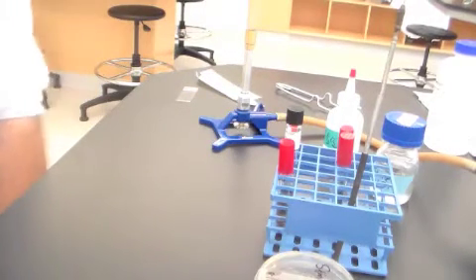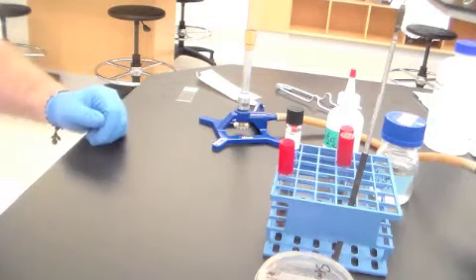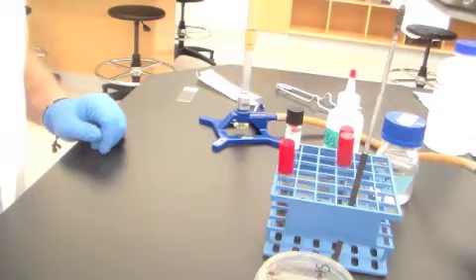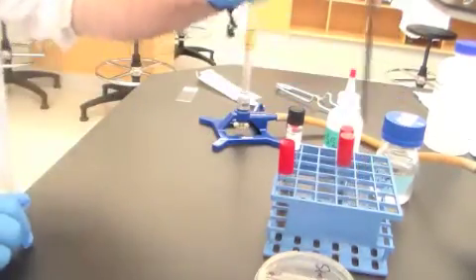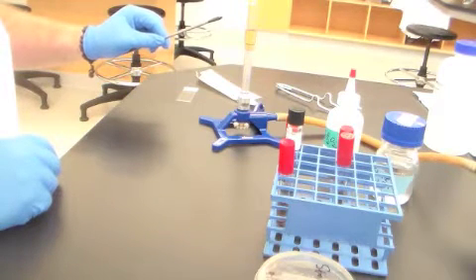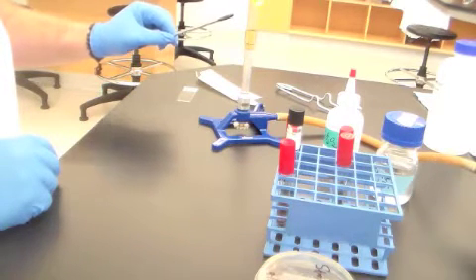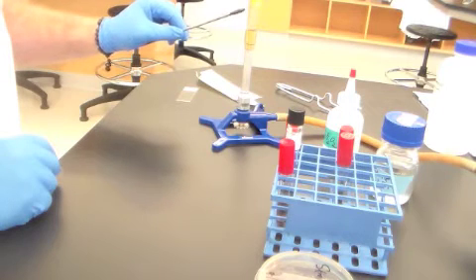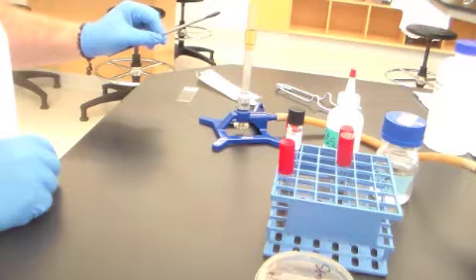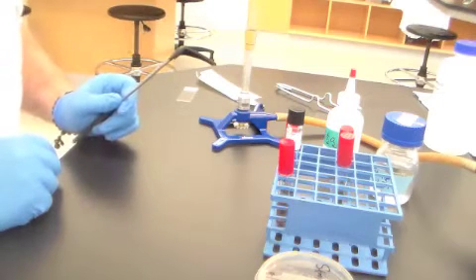Good morning. So I want to, in this pre-lab video, go over some of the inoculations and the one test that you will complete this week. So this week is, like many weeks, going to be very easy because all you're going to do this week, for the most part, is to inoculate several types of media that you will perform tests on the following week.